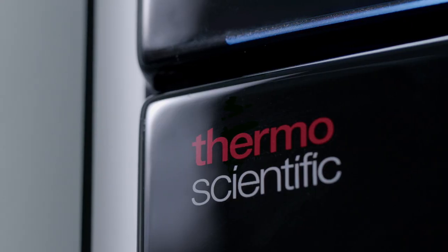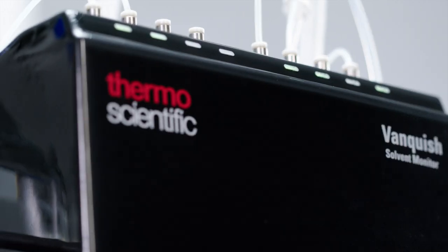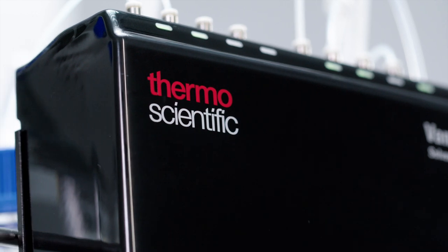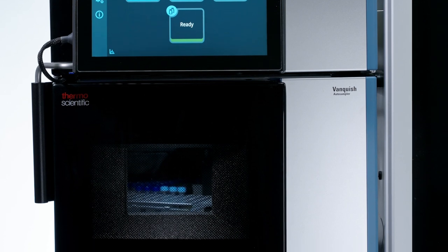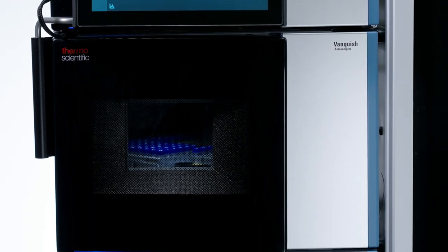Designed to bridge the gap between routine HPLC and LC-MS, the Thermoscientific VanquishFlex UHPLC systems provide unparalleled flexibility to address all your analytical challenges.